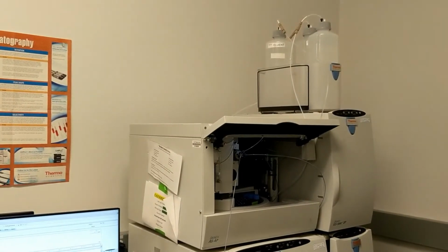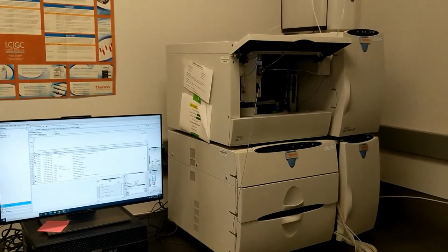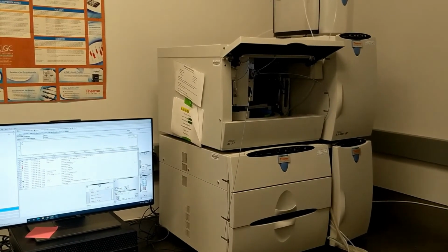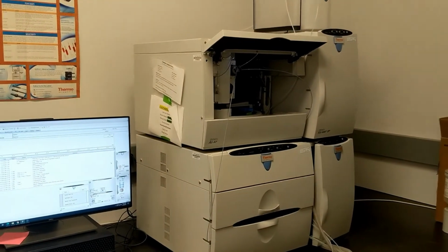All right, so those bottles are filled. Now the next thing we need to do is prime the pumps. And this means that we're going to get the system full of liquid, make sure that there's no air bubbles in the system, obviously because air is bad for the system, before we start the run. So, you won't always need to do this. You'll only need to do it when the pumps are off.